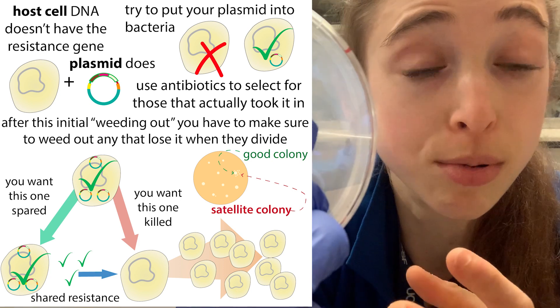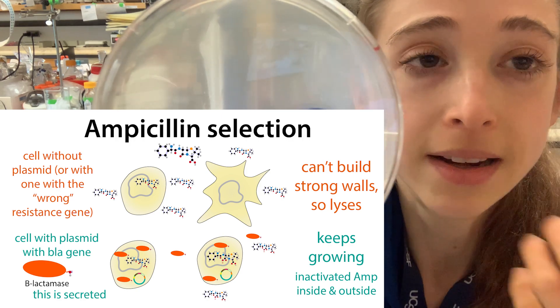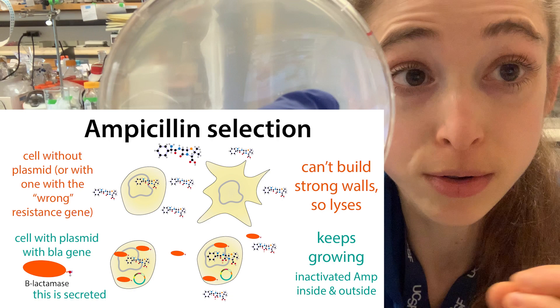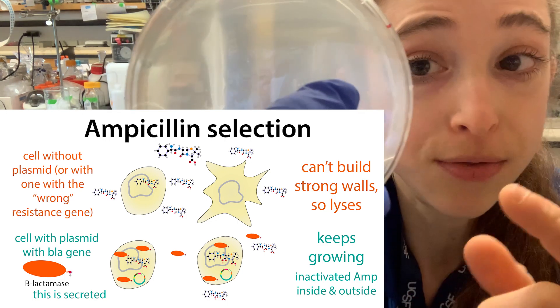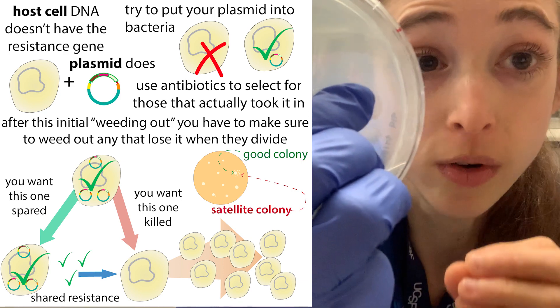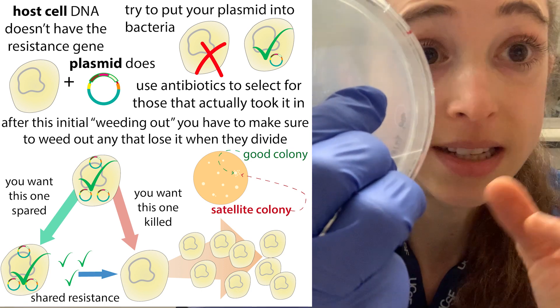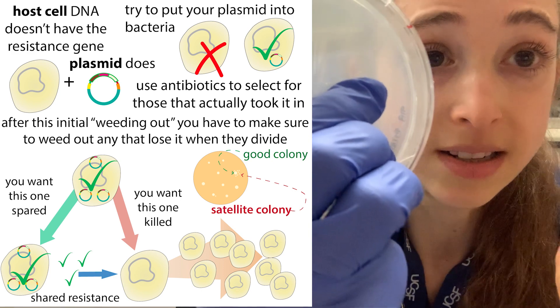This is mostly a problem when we're dealing with ampicillin resistance. We use this resistance gene as a selectable marker called bla, and bla makes beta-lactamase. Beta-lactamase is going to destroy antibiotics in the beta-lactam class, including ampicillin and penicillin. It gets secreted out of those cells that have this gene, and it's going to protect those cells but also the cells in the surrounding area. If you allow plates to grow too long, you'll get a buildup of beta-lactamase around the bacteria, and ampicillin isn't going to be very stable for long either.